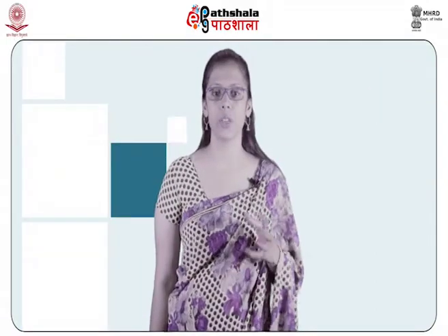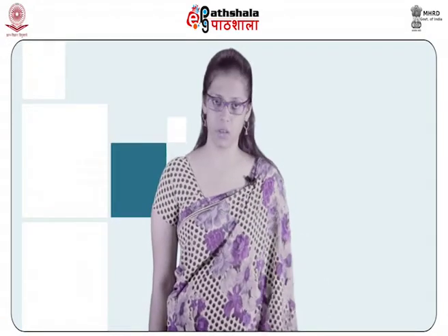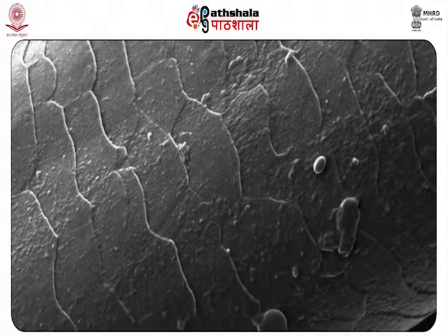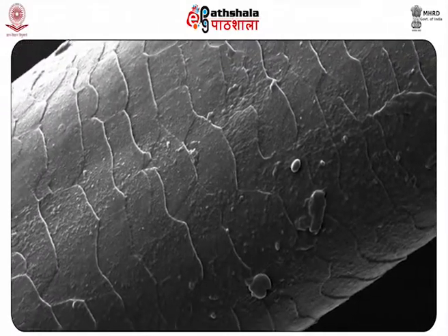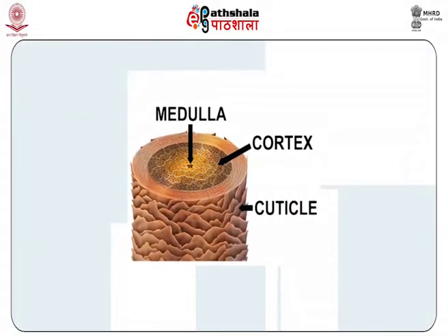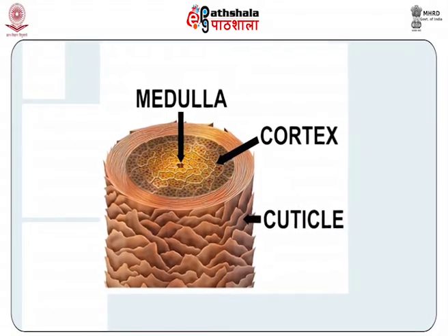Evaluation of the minute characteristics of questioned hair to identify hair samples helps to govern whether a transmission may have occurred. Structure of hair. A hair strand has a complex arrangement consisting of numerous layers. If we start from the exterior, we find the cuticle, which comprises layers of flat, thin cells coinciding with each other like roof shingles.